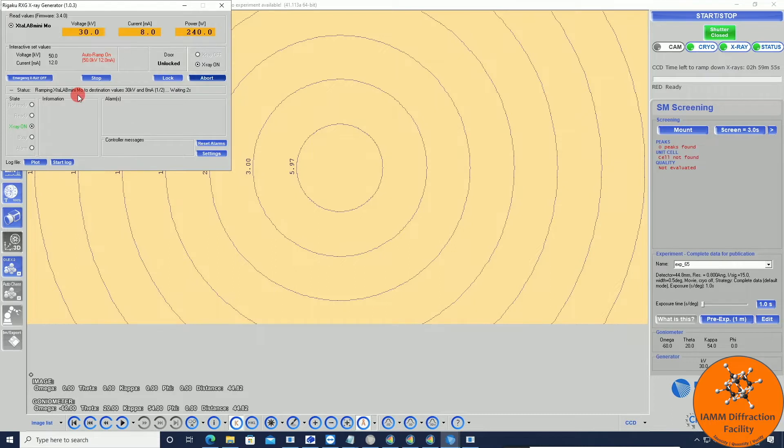Then we see here that it should start ramping up. Ideally, you want to do this before you start trying to mount your sample on the sample holder, that way it gives the system enough time to warm up and reach equilibrium. I'm not going to worry about that today because this is just a demonstration. I see now that it is 50 and 12, which is what we want, so I will close that.